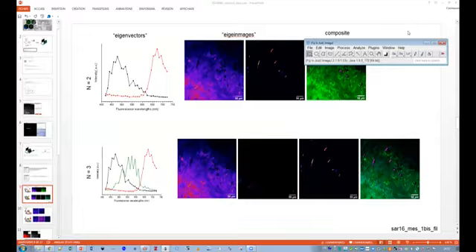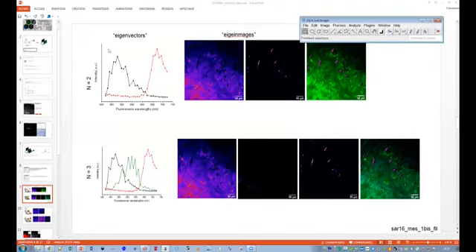So go back to my sample. I did. Juliette, what was the second image then? So the first one is a composite, the overlay, and the second one was.